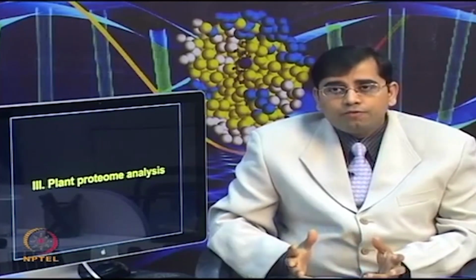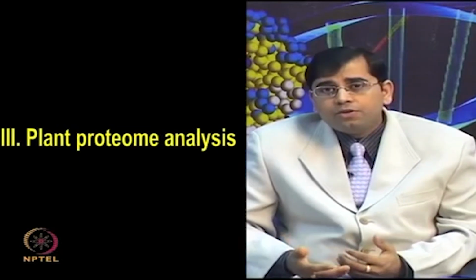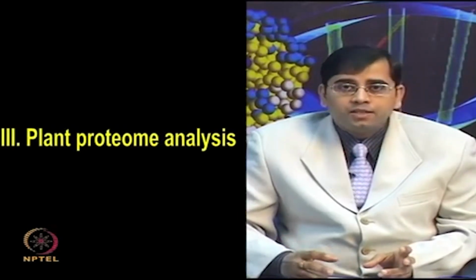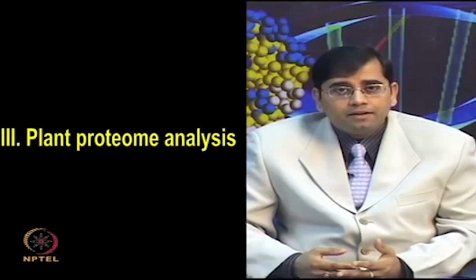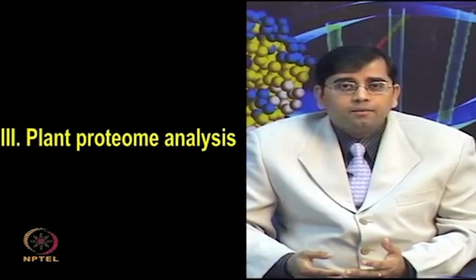So, in the flow of the sample preparation strategies, I try to give you a feel of different types of samples available and the challenges which are associated with each sample type. We talked about human serum, we talked about bacteria, and now let us talk about plant leaf, how to analyze the plant proteome.